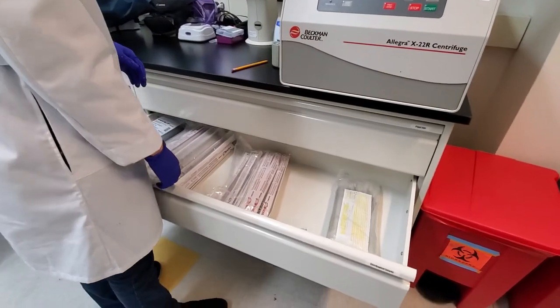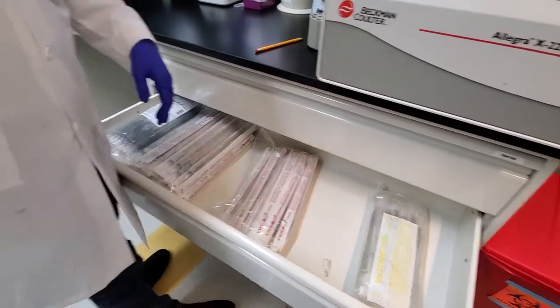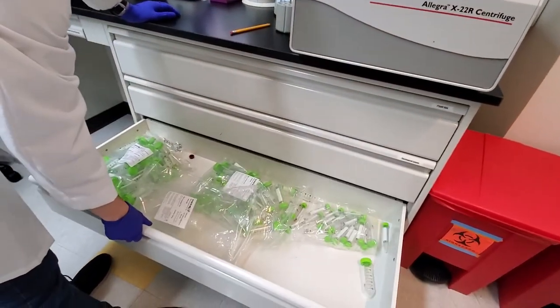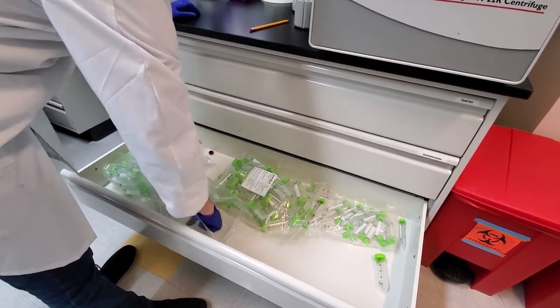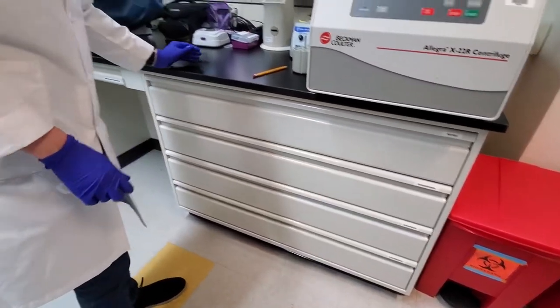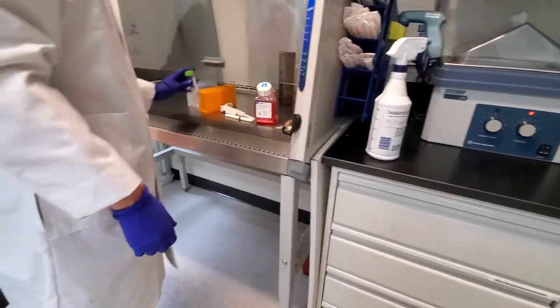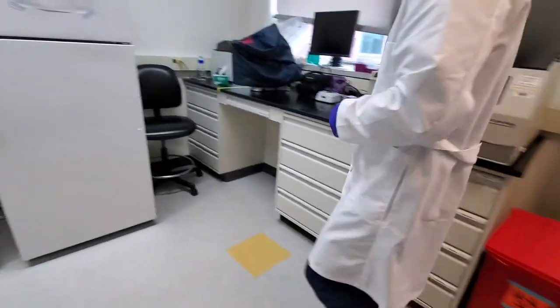For the pipetters, the large pipetters, we keep the main stacks in here, but on either side of the hood we have the individual ones. Some conical tubes here, we should have stacks of 15 and 50 ml. If we run out here, we keep more in the lab in various places, so you sort of have to hunt around, and if it gets low, we need to order more. Once we mix up the media, we'll pour some in there and use that to dilute the cells that we've got.